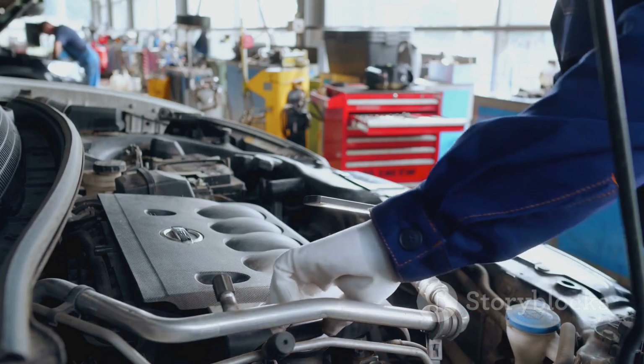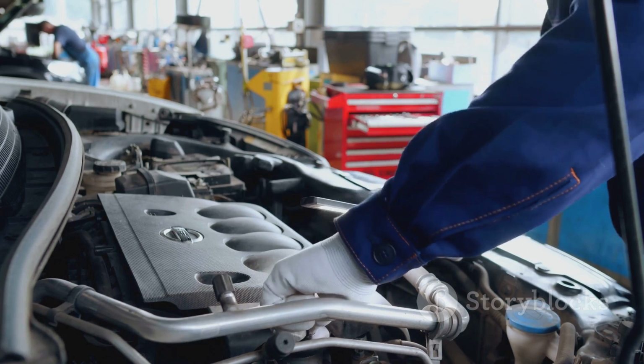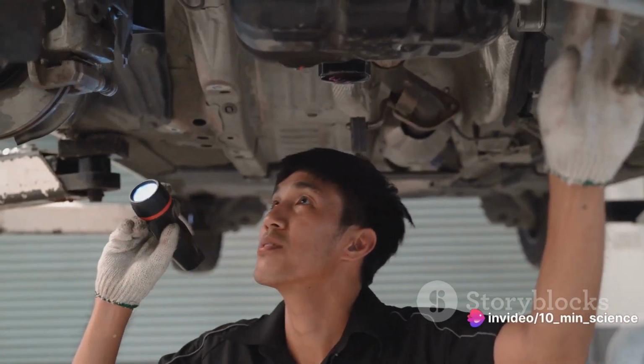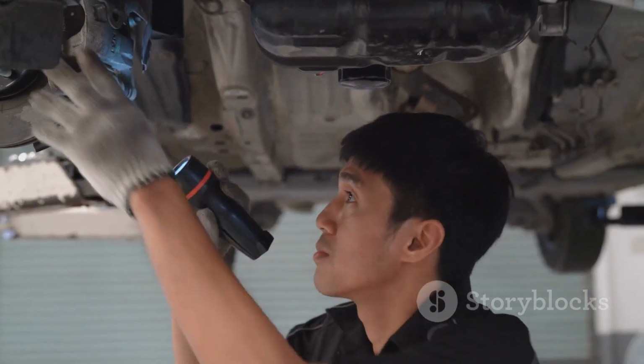Moreover, system suitability is not a one-time thing. It's a continuous process that needs to be carried out regularly to ensure consistent performance. Just like a car needs regular maintenance to run smoothly, our chromatographic system needs regular system suitability tests to ensure it's performing optimally.